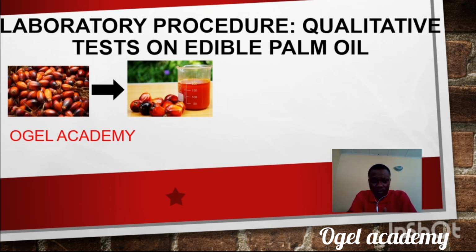It's high time for us to unravel what we have before us at this point in time: the laboratory procedure on the qualitative test on edible palm oil.